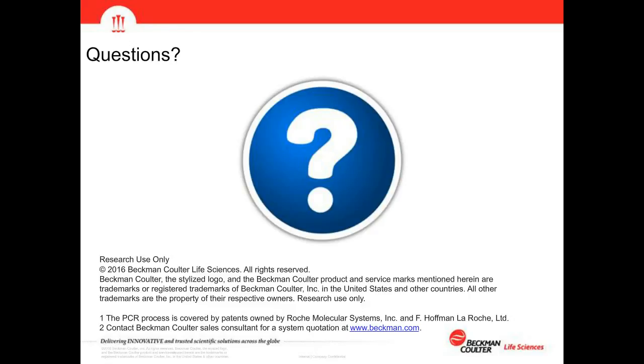I guess I would need clarification on the BD auto machines. Okay, is that maybe Beckman Coulter? You know what? It says using BD. The person was not more specific than that. I'm sorry if that's okay. I'll answer with the assumption that they meant Beckman Coulter Biomek automation.